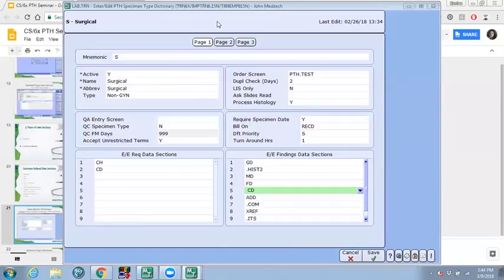As I mentioned, page 3 is not a default. The findings or the data sections entered on that prompt will queue the cases to appear in the MISQ sign. However, there are accesses that will determine whether or not cases will appear in the MISQ sign routine, which Alicia will be going over after we are done with the pathology dictionaries. But page 3 is to queue, or it's an indication of when a certain case will appear in the MISQ sign, and it is not a default.